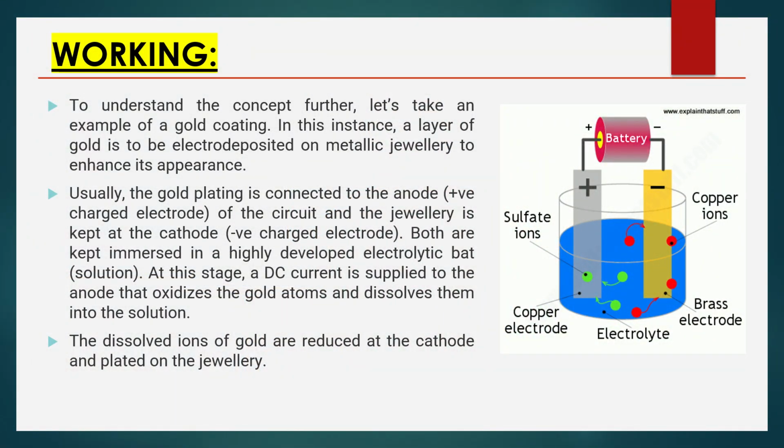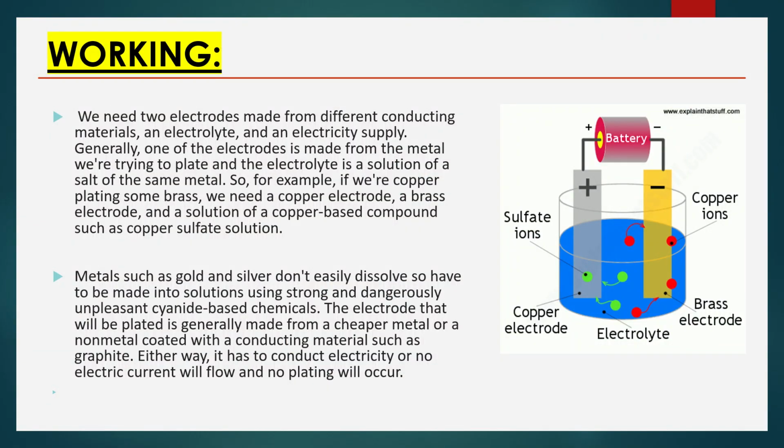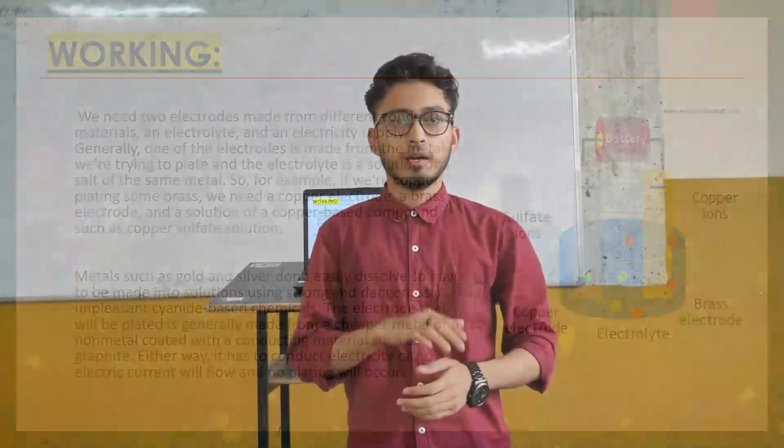Hi everyone, this is Prashant Kumar and I am here to explain the working of electroplating of copper. To understand it, we are going to take an example of electroplating of gold coating on metallic jewelry to enhance its appearance. As Ranjit told you, at the anode we take the metal which is being plated, and at the cathode we take the article which is going to be plated. So we take gold plating at the anode and the metallic jewelry at the cathode. After that we immerse them in the electroplating bath solution. Then we switch on the power supply, and that's when electricity passes through the anode, where oxidation of the gold plating takes place, and the gold ions get dissolved in the electroplating bath solution.